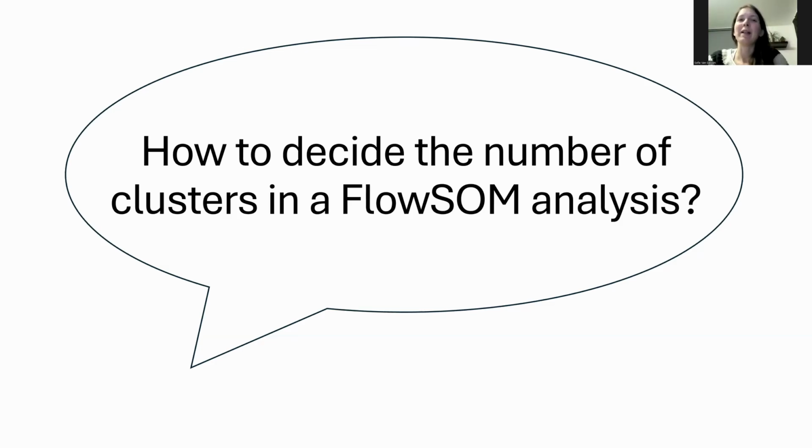Hi everyone, welcome to this episode of Cytobytes, where I will talk about one of the questions I get asked the most often. How do I decide on the number of clusters in a FlowSOM analysis?